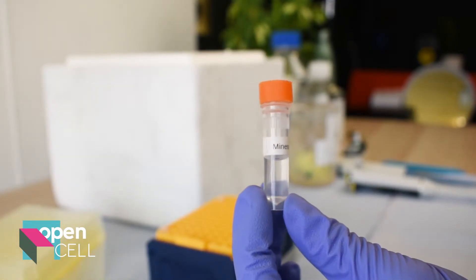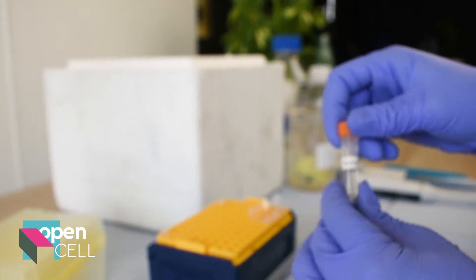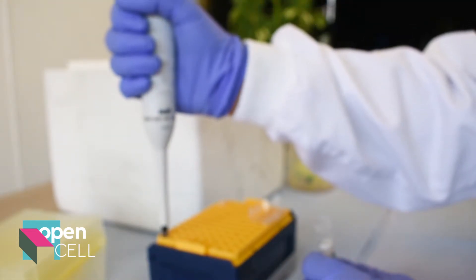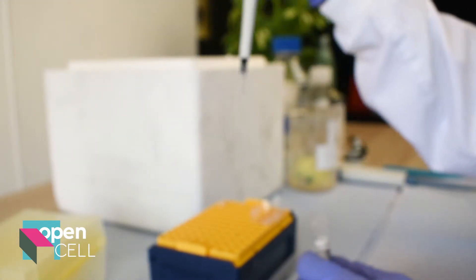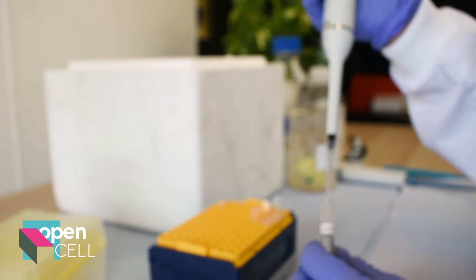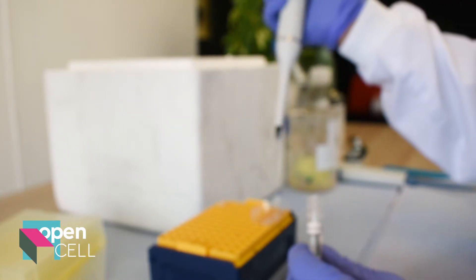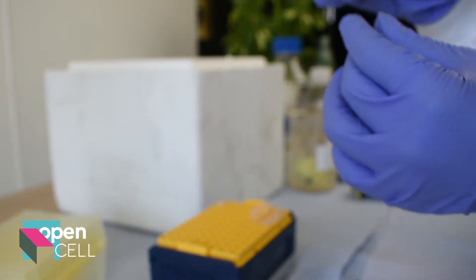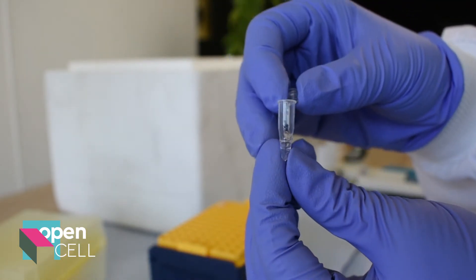Because this machine doesn't have an outer casing, you will have to put some mineral oil into your samples, which will help prevent them from essentially evaporating away. And here you can see it just chilling on top in a separate layer.